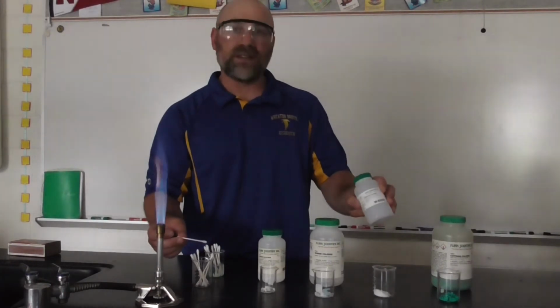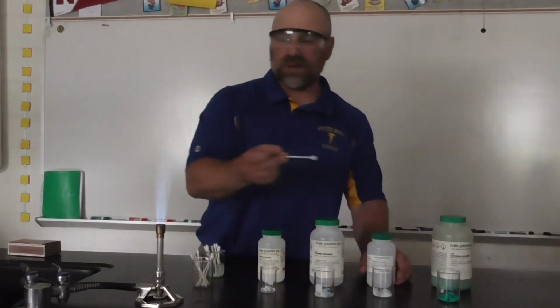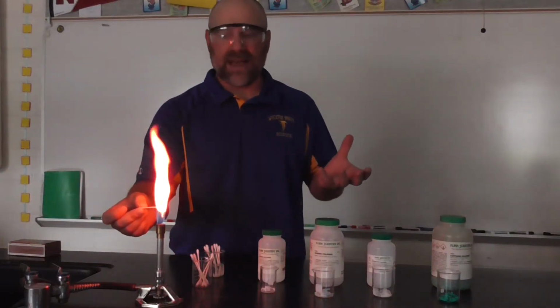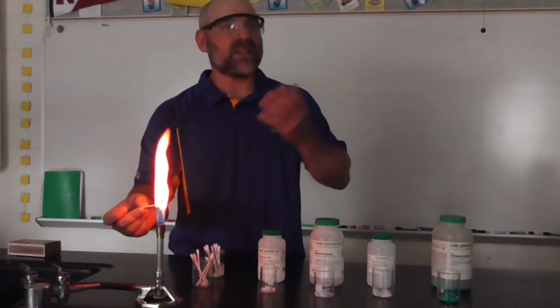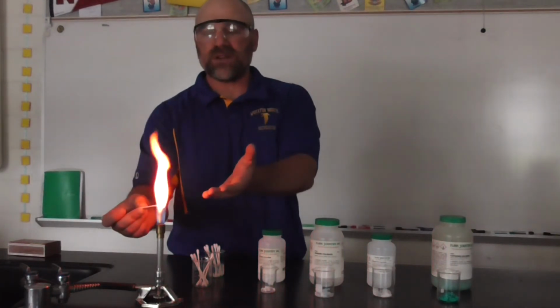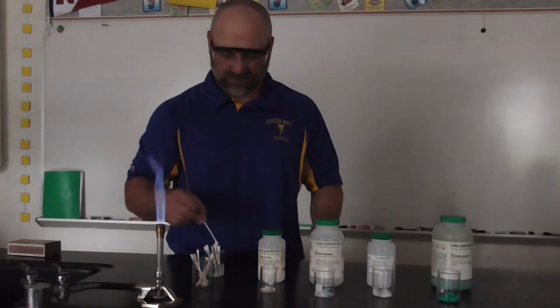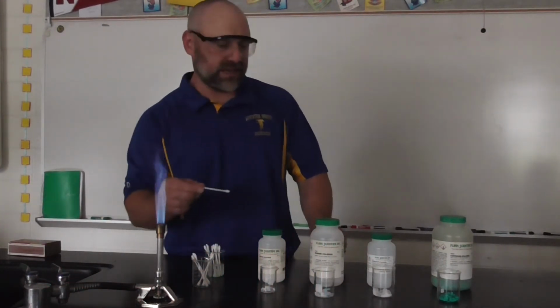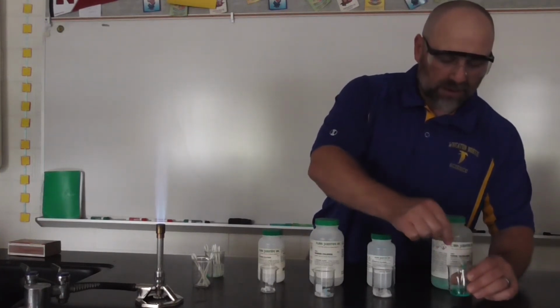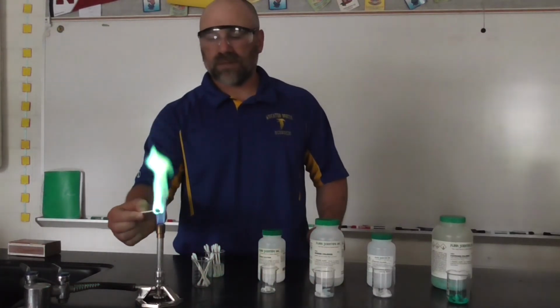This next one is strontium chloride. Strontium chloride is pretty famous if you've ever seen a road flare. You can see that kind of red road flare light. Again, it's going to emit photons all throughout the visible, infrared and ultraviolet spectrum, but the ones that you're seeing are primarily in that red and orange range. The last one you're going to see is copper chloride. Copper chloride is going to emit a kind of blue-green color.